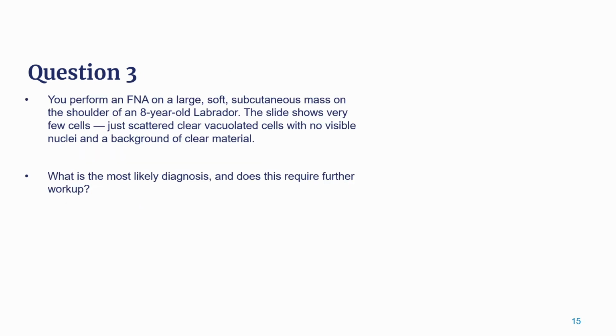Question 3. Almost no cells, clear vacuoles, no nuclei visible. This slide looks almost empty. What are you looking at, and is this a reassuring or a concerning finding?